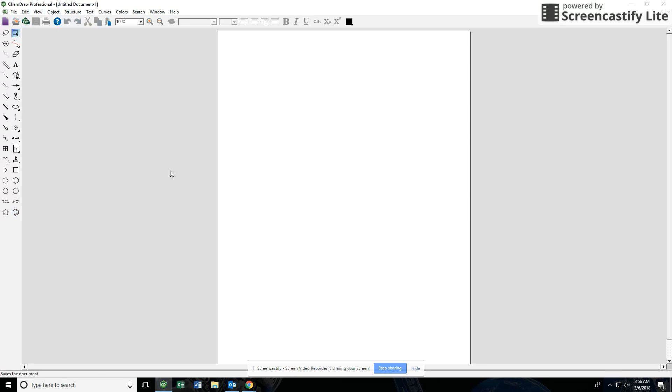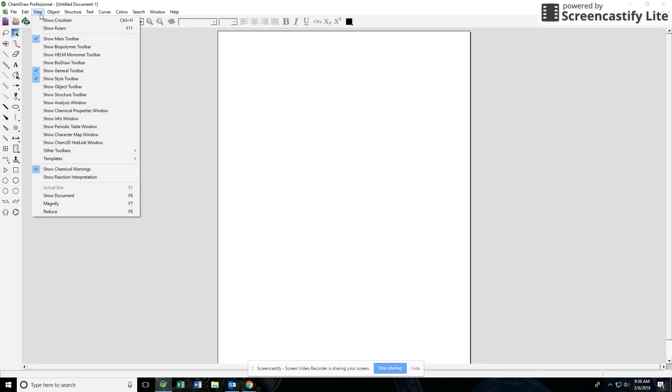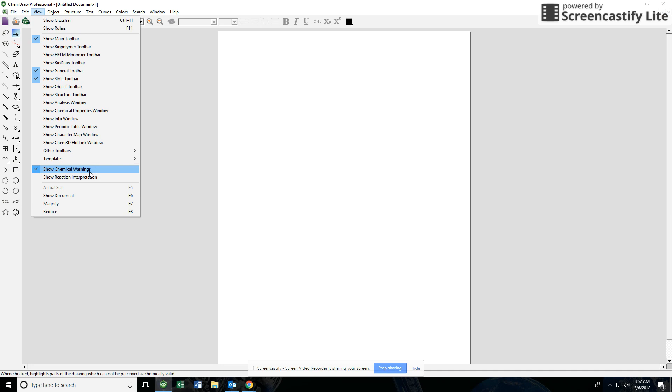If you're missing a toolbar you can go up here to the view menu and you can see which toolbars. I have selected here the main toolbar, the general toolbar, the style toolbar, and then chemical warnings that'll show you what's going on if you have a mistake in your drawing or at least something unusual if you start to violate octet rules or things like that. So this is kind of how my setup is and this would be my recommendation.